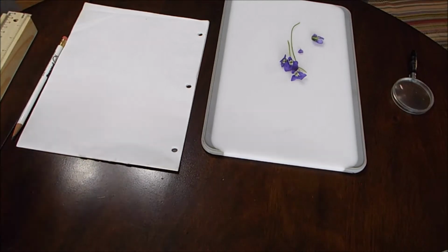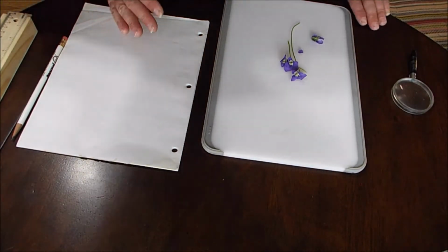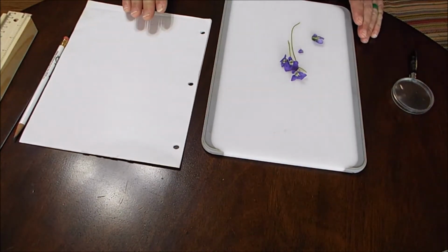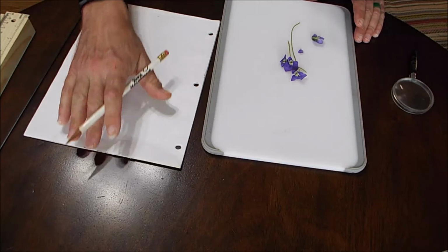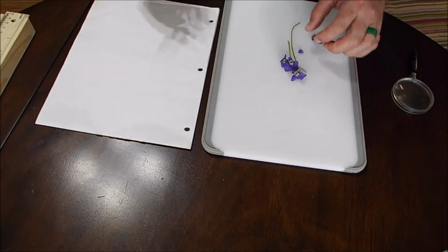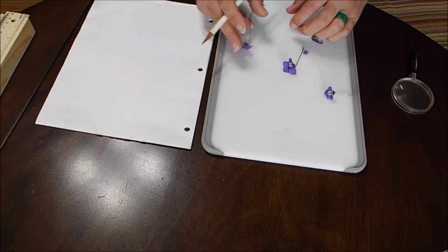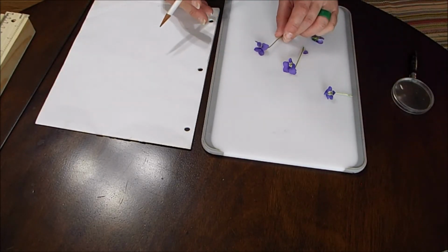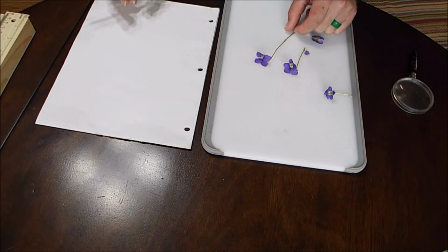Alright, so now I've got my flowers here on a working surface, and again, the first thing you should do is look at, or read very carefully actually, the little guide to scientific illustration that I have posted on Moodle. So let me take one of these guys here, and the first thing I'm going to do is draw just an aspect from the side.